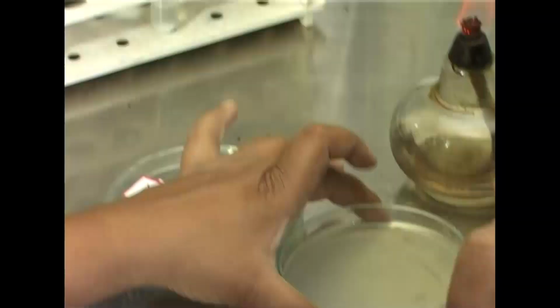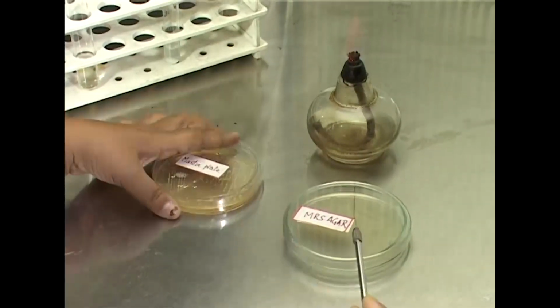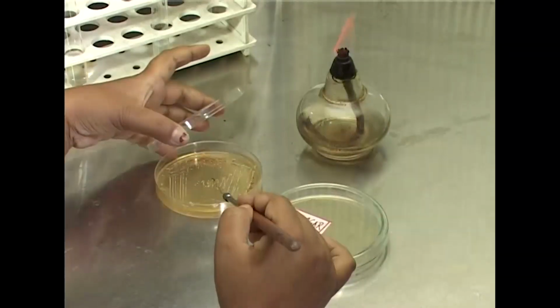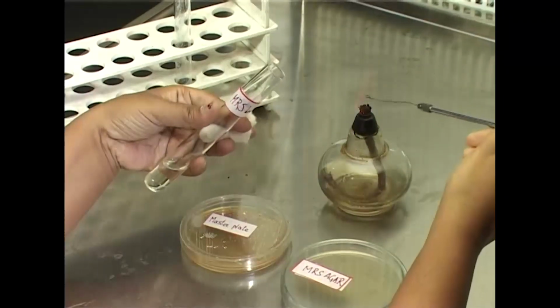Okay. Next one, isolation of lactic acid bacteria from curd. So, from the streak plate pure culture, the colonies will be taken and streaked over the specific selective MRS agar medium, either solid agar medium or in the broth of MRS. Physiological and biochemical characterization can be done with the help of gram staining, catalase assay as well as sugar fermentation, etc. Because if it has the potency to ferment sugar, within the inverted Durham's tube it will produce a bubble, designating the carbon dioxide formation, as well as different other tests.